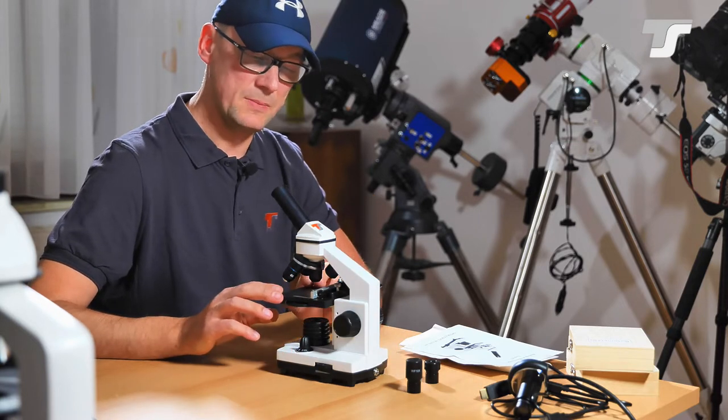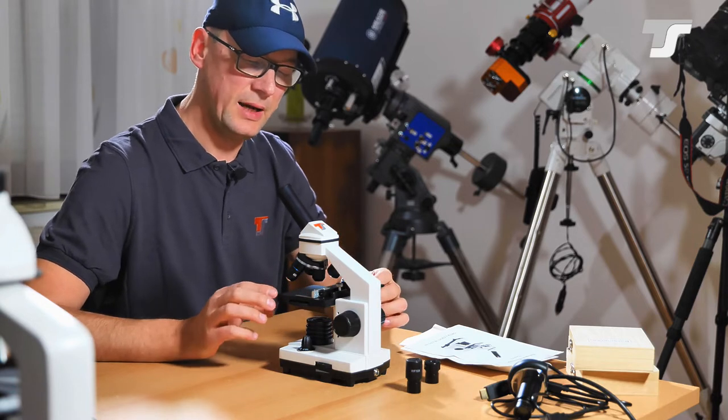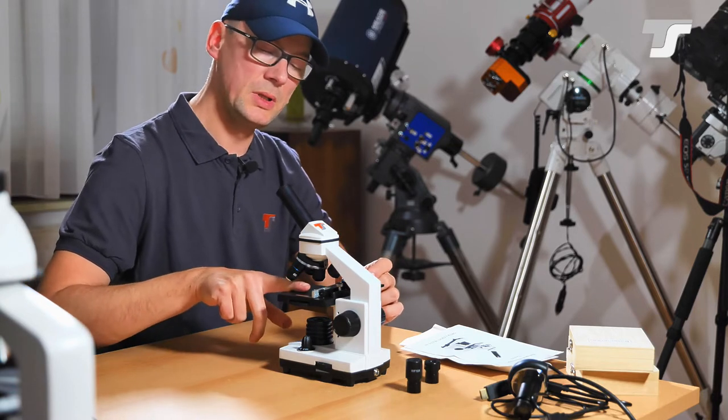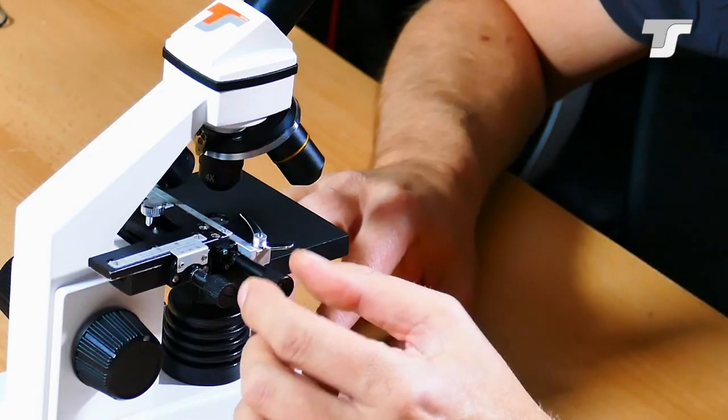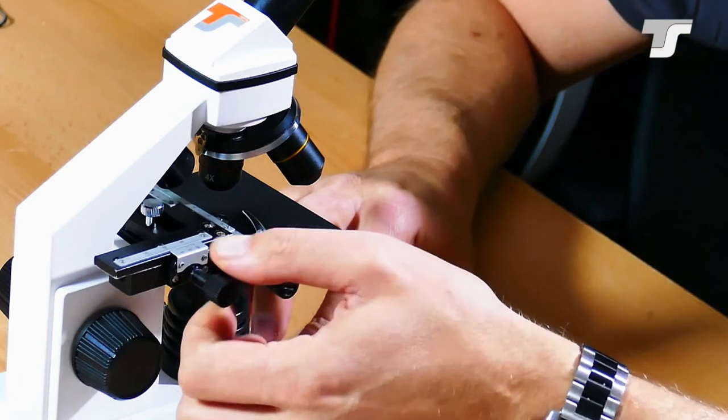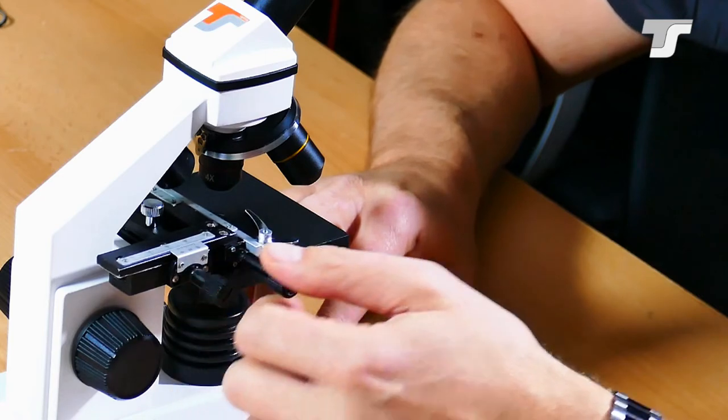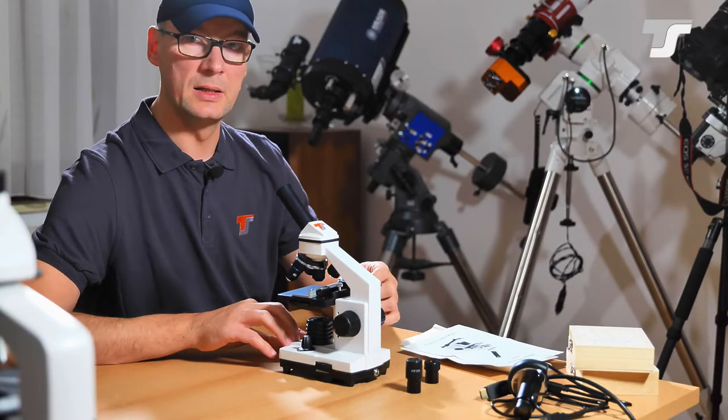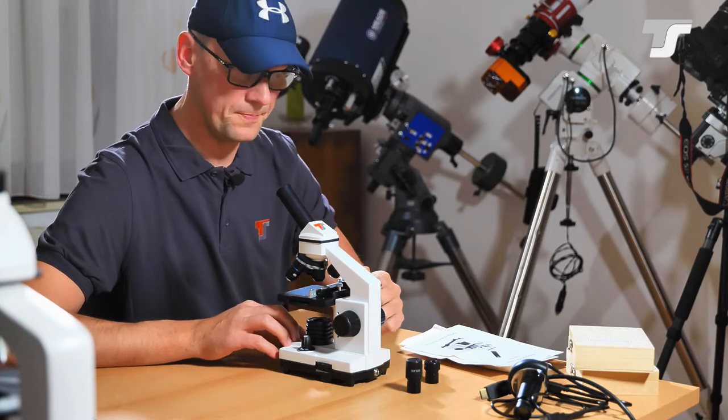The next thing, of course, the most prominent thing here is this cross table. When you put your sample on this table, you can move it exactly around by using these rotating knobs here. This will just move your sample around to get it in the perfect position to your field of view.